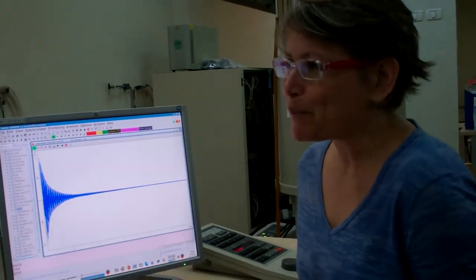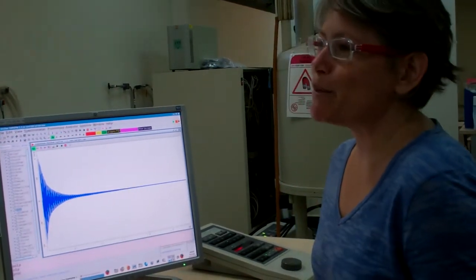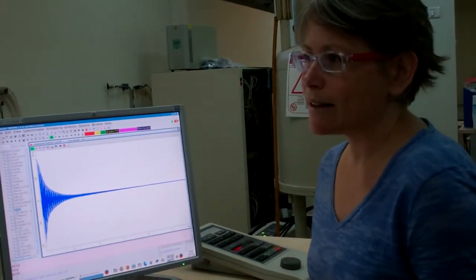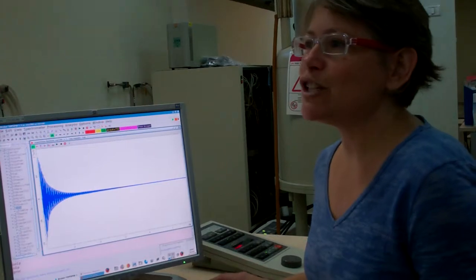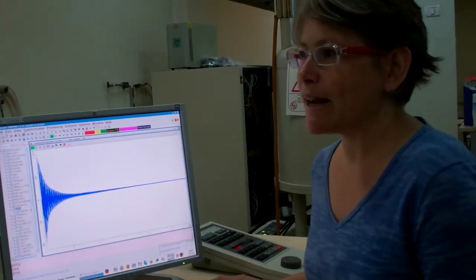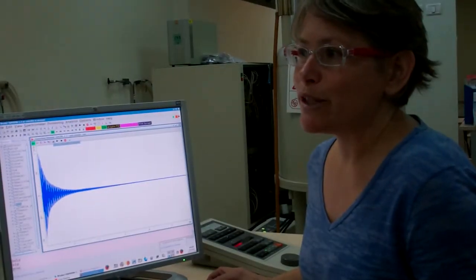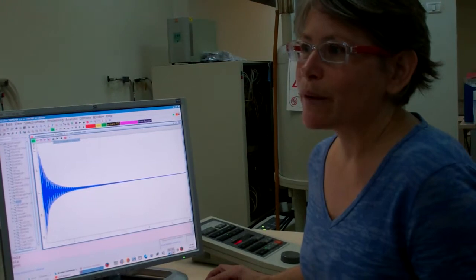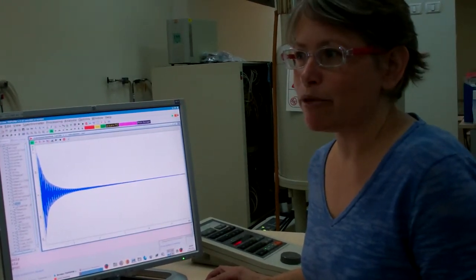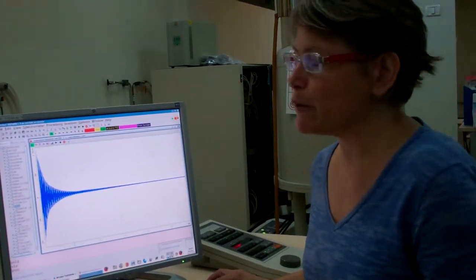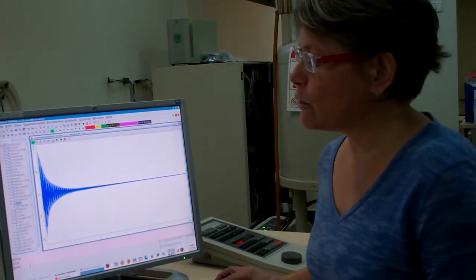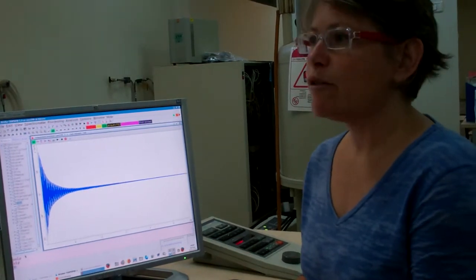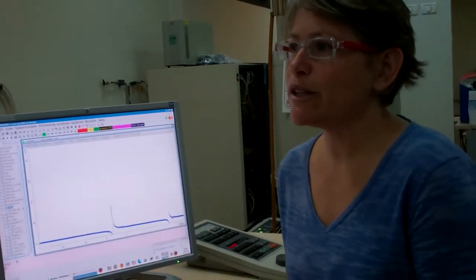Are you ready? We're on step number 9, Processing. The Acquisition tab is highlighted in the menu. This is our acquisition window. To go from the time domain to the frequency domain, we'll type FT for Fourier transform.